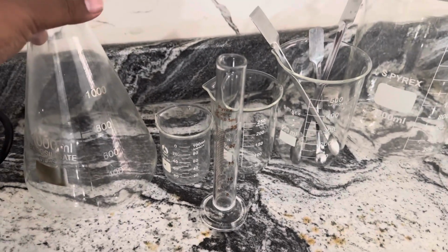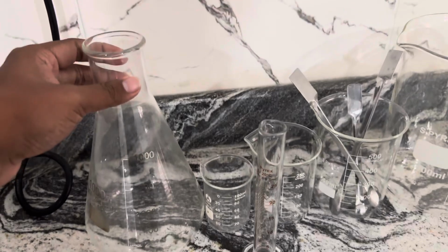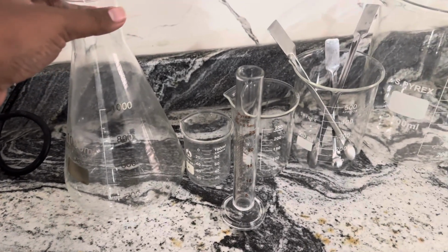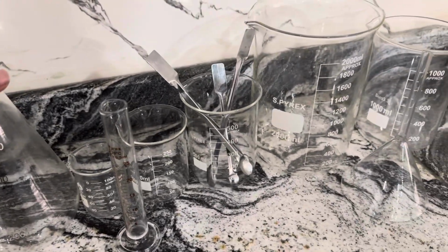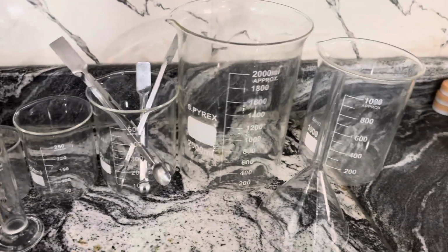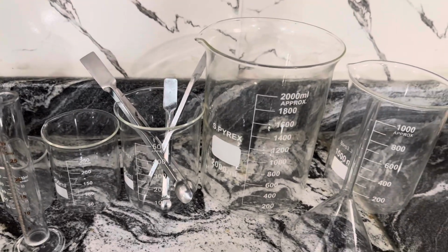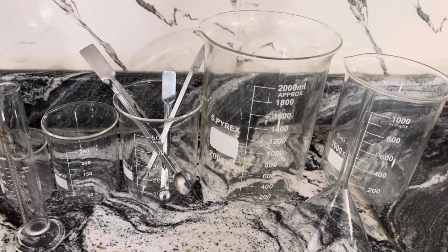And this one you can see conical flasks. The conical flask is also important for making a solution or something. So if you are working in the lab, an analytical lab, then you must know these things very well.